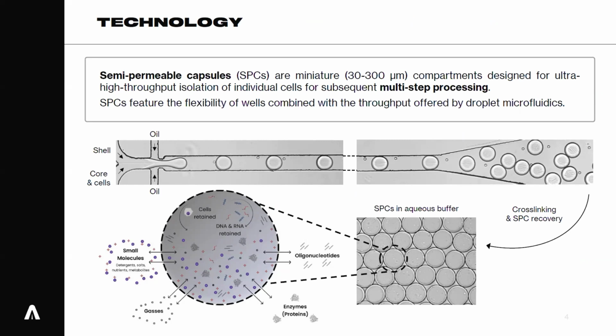To stabilize this so-called aqueous two-phase system, we expose droplets to light, and at this point, the shell polymer that is located on the outer surface of a droplet solidifies and becomes a very stable porous hydrogel. Once the capsule is formed at this stage, it exhibits a lot of properties that are advantageous for microbial workflows. First of all, this hydrogel shell is very chemically stable, so you can use various harsh chemicals to lyse the cells. For example, alkaline lysis buffers, lytic enzyme cocktails, temperature treatment.